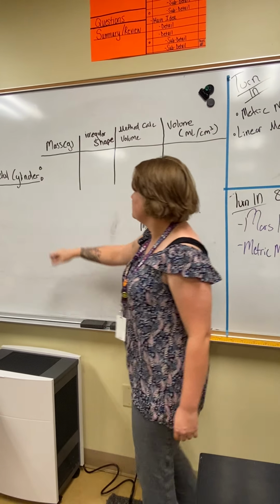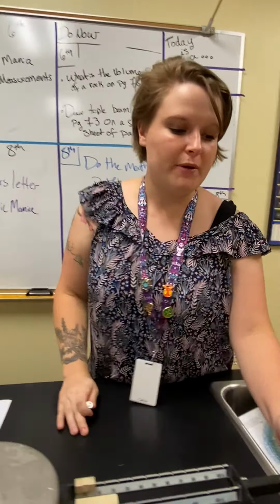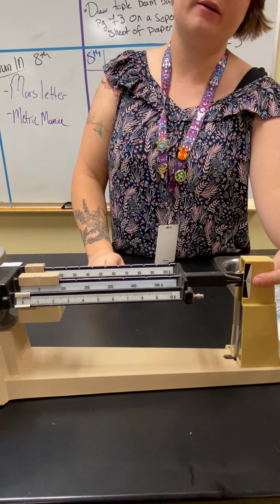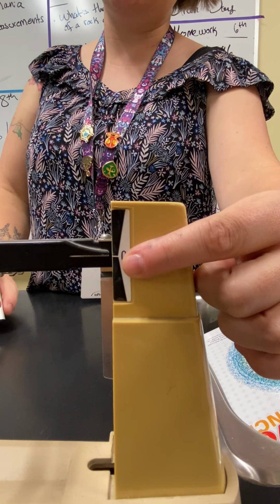Now, mass. Let's go ahead and start with mass. Mass we measure in grams. So we're gonna go over here. Now, the name of the game is to get the mass of the metal cylinder. You see how this line lines up with the zero? That means that we are zeroed out. That means we are ready to take our mass.